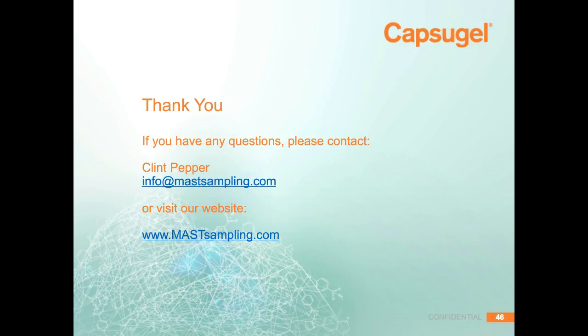All right, thank you. Could you clarify the point about protein recovery by the cell removal system? Does this mean titer cannot be accurately quantified from cell-free samples?